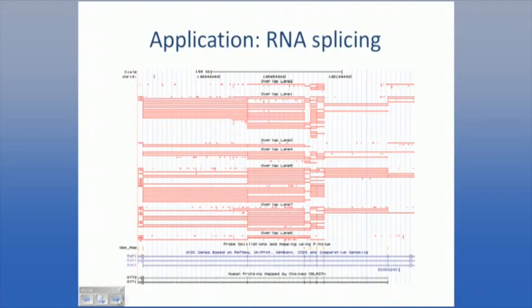So here's an example of mapping out splice junctions for one particular gene, SYT1. And what you can see is that the various exons, which are here at the bottom of the screen, have multiple reads that span various exons. So here you can see reads that span between this exon here and this exon here, and pretty much all of the exons in the transcript are covered by these events. And from looking at these events, you can find issues where you have retained introns, alternative exons, mutually exclusive exons sometimes, and the various other events.